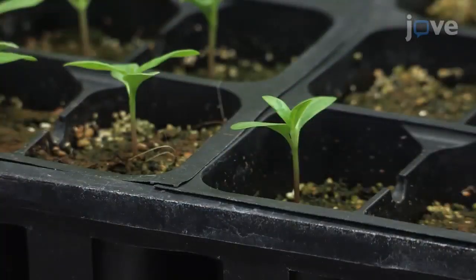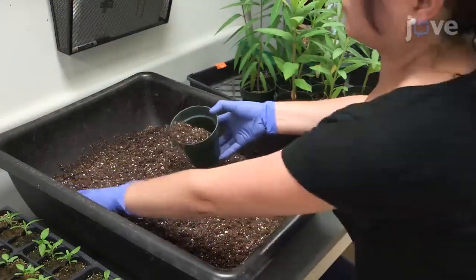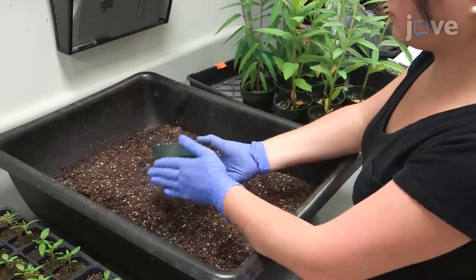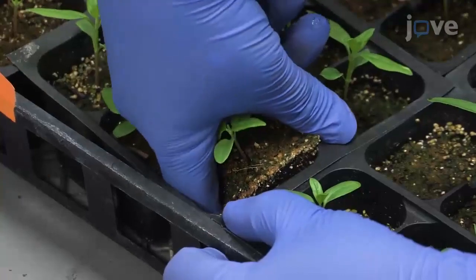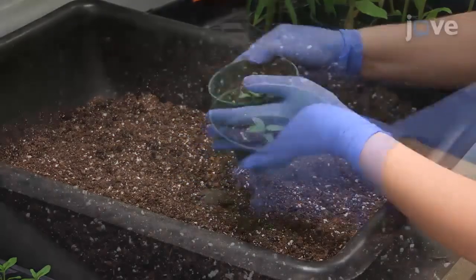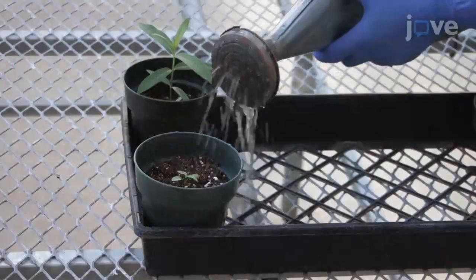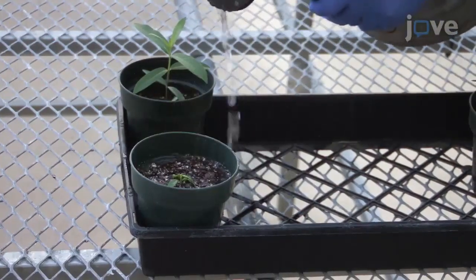When the seedlings have grown their first set of full leaves, fill 4 inch round pots with potting soil up to about 5 cm below their rims. Create a hole in the soil deep enough to reach the bottom of the pot and gently scoop the mature seedlings by hand to place them deep within the holes in the new pots. Then cover the seedlings with soil and water the seedlings daily to every other day to maintain a moderate soil moisture level.